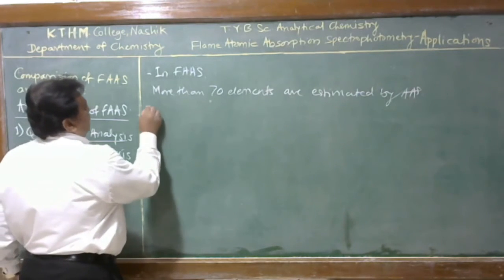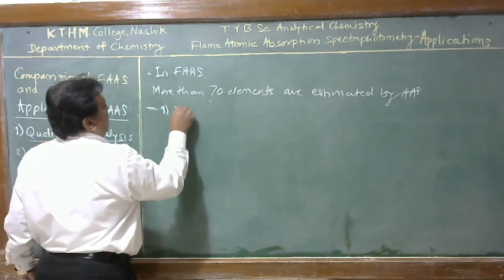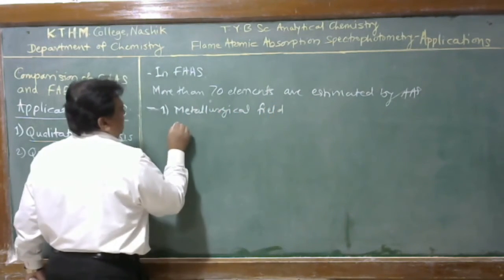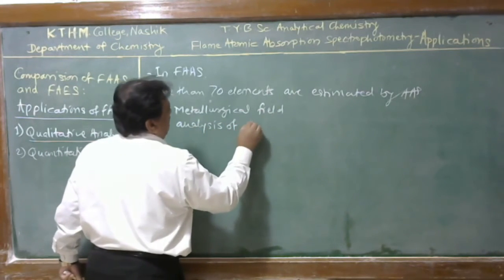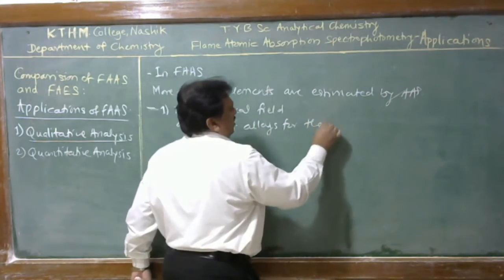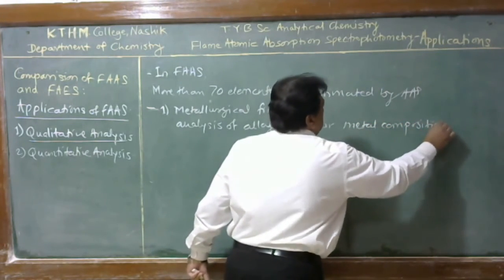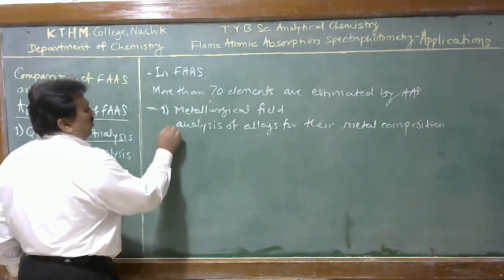Special applications, number 1, in the metallurgical field, for analysis of alloys for their metal composition. Therefore, an alloy can be analyzed for determination of metal composition.